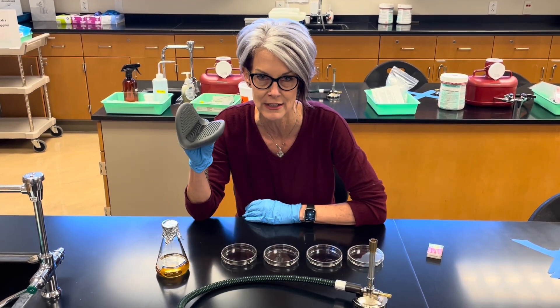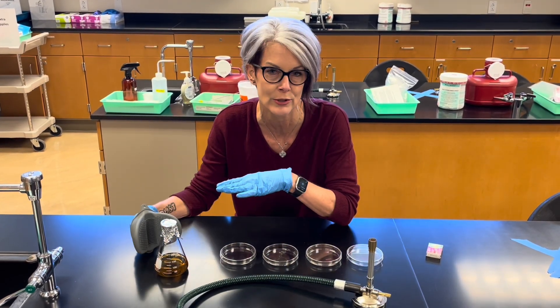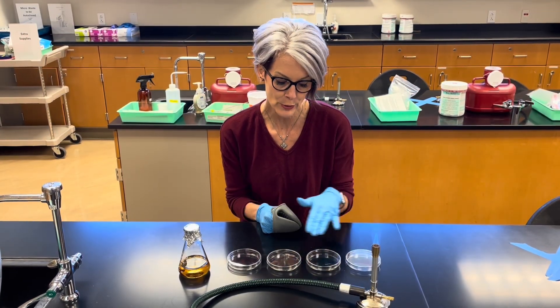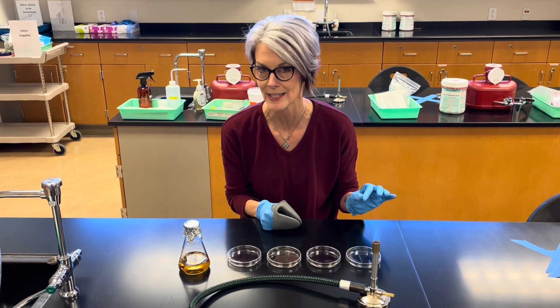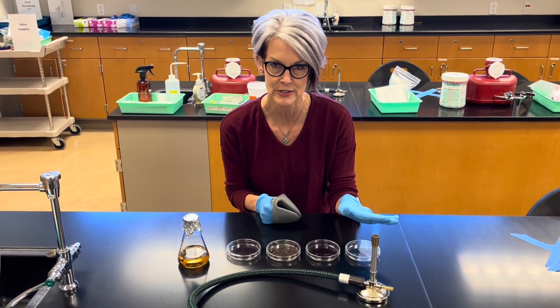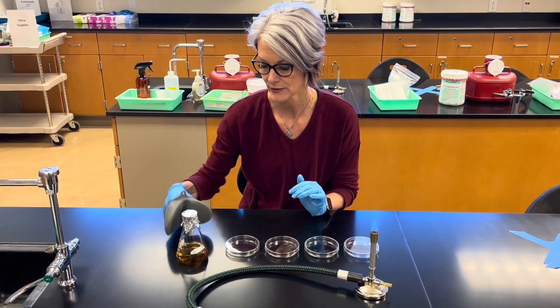You will need a set of hot hands to handle your flask. Your goal is to pour the four nutrient agar plates aseptically — meaning without contamination. So make sure that your Bunsen burner is lit and that you have your hot hands.